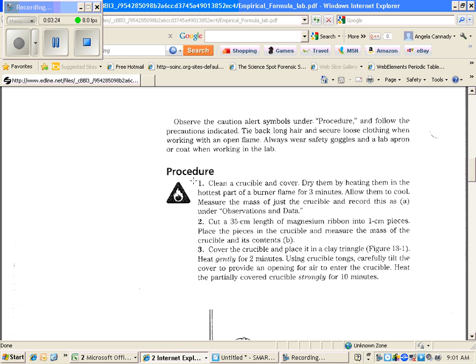So you're going to clean your crucible. After you clean it, it's going to be wet. And you're going to heat it for three minutes. That's just to burn off all the water and get it completely dry or as dry as we can.